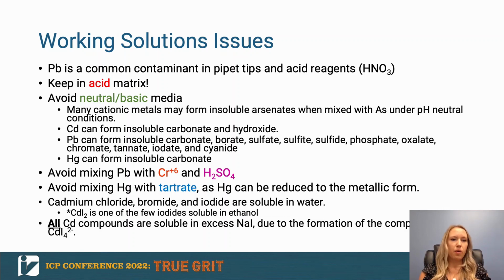That brings us to our working solutions. The main thing you want to keep in mind for a Big Four analysis is you want to keep your working solutions in acidic matrices. These elements can all form insoluble precipitates in a neutral or basic matrix, so you want to make sure that you're keeping those in acid.